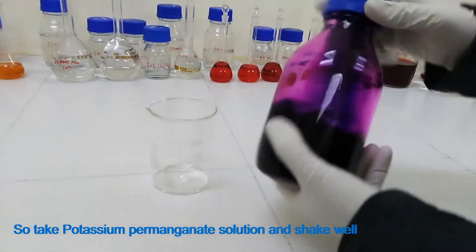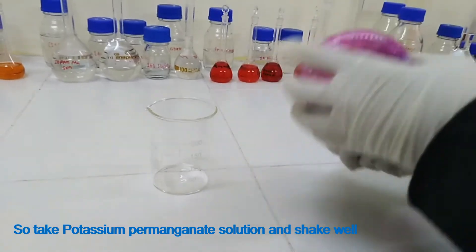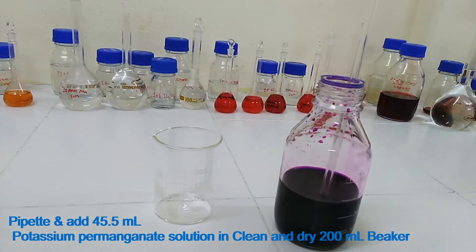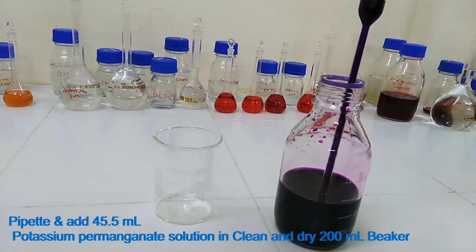From the previous video, we found that 45.5 ml potassium permanganate solution is needed to prepare 1000 ml 50 ppm manganese stock solution. So, take potassium permanganate solution and shake well. Then pipette and add 45.5 ml potassium permanganate solution into a clean and dry 200 ml beaker.